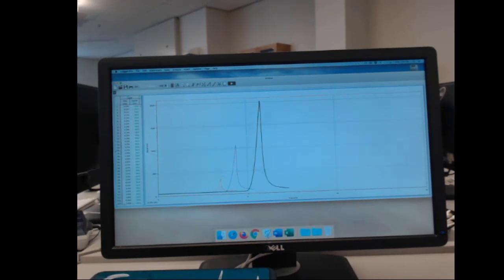Each of these peaks can now be related to the amount of interactions the chemical compound has with the particular tube inside of this chromatographer. This comparison for these three chemical compounds is relatively straightforward because they have the same molecular weights and the same functional group, with only a difference in the amount of branching, which gives rise to a different amount of surface area or a difference in London dispersion force.